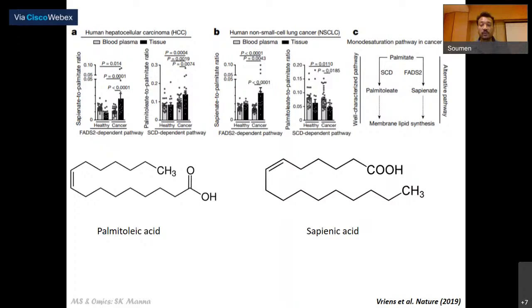So this is again a new alternative pathway that we uncovered using the power of mass spectrometry, complemented, of course, with other molecular biology techniques. And that is always true. Mass spectrometry itself is not an answer to everything, but it gives you a lead on where you should look and what kind of thing you should do.